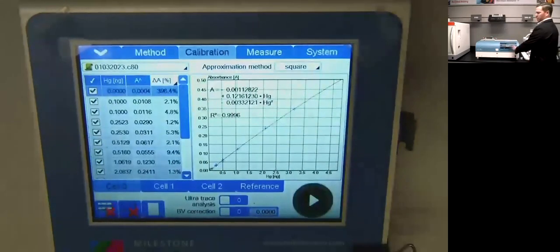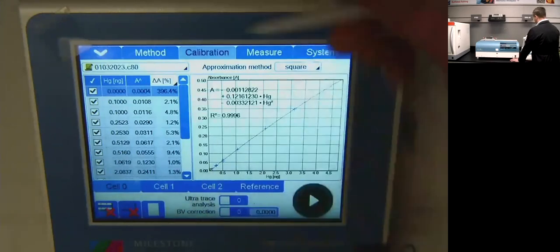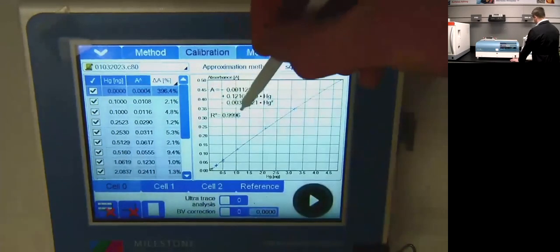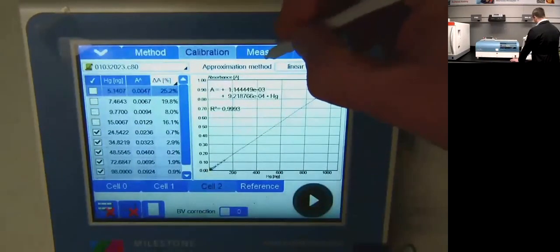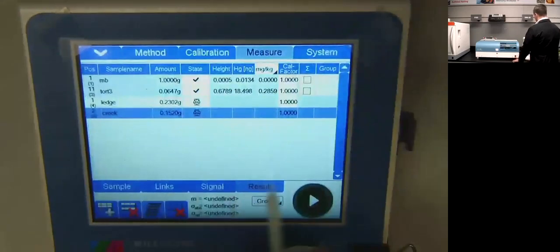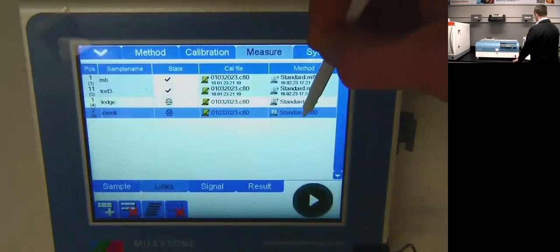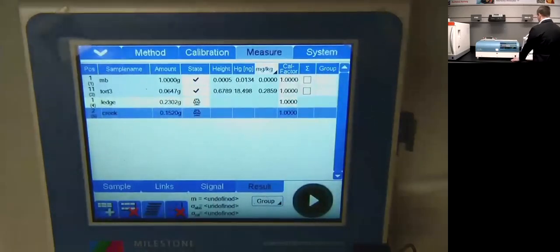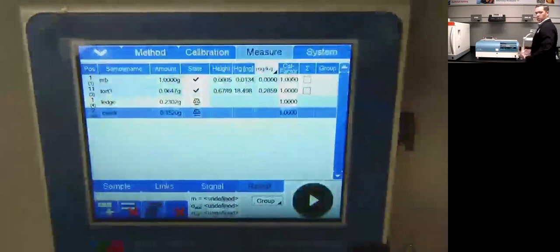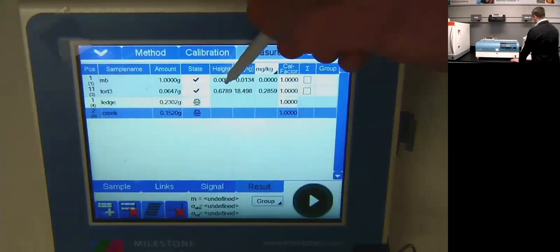On the calibration tab, I have a tri-cell with three different cells to measure low, mid, and high ranges. Each cell has its own calibration point and you can see the R-squared values — we've got three good curves and we're ready to run. I start my day by running a blank and check my mercury height to make sure I have a clean system — and in this case, I have a very clean system.